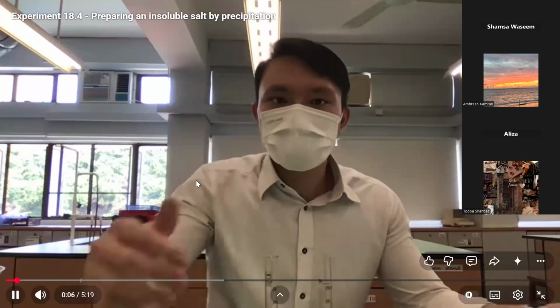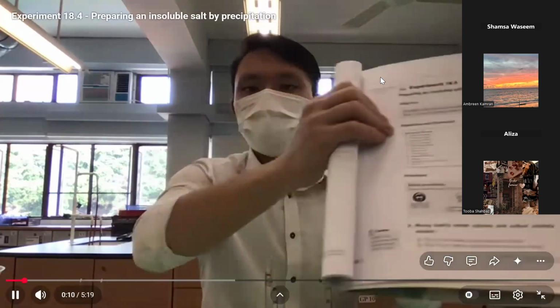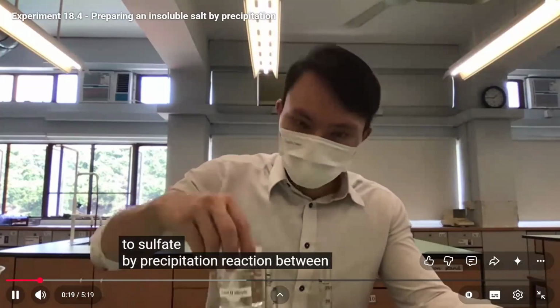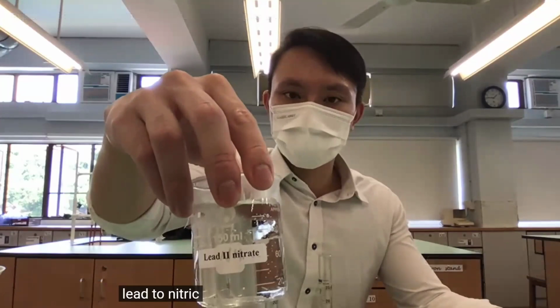In this video, I will demonstrate experiment 18.4, preparing an insoluble salt by precipitation. In this experiment, we will prepare lead-2 sulfate by precipitation reaction between lead-2 nitrate. ठीक है, अब देखो lead-2 सल्फेट बनाना है बच्चों, तो एक insoluble salt lead सल्फेट ना, तो lead का नाइट्रेट ले लोगे फर्स्ट पार्ट का, ठीक है। And could you predict what should be another salt बच्चों? Which sulfate we should use?